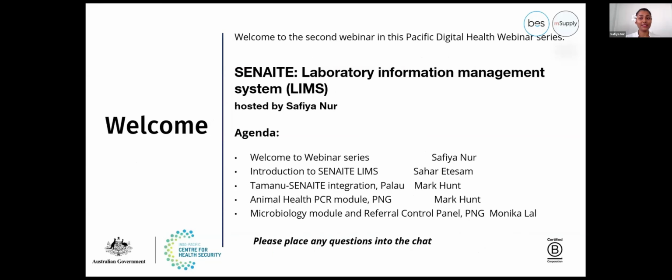Now, this session is about SENAITE, like I have mentioned, the Laboratory Information Management System. The heroes of this product here at Beyond Essential Systems are Saha, Mark, and Monica. Any questions you have, they are the 3 main people to go to. They will be talking about 4 different topics in context of 2 different Pacific Island nations, Palau and PNG.